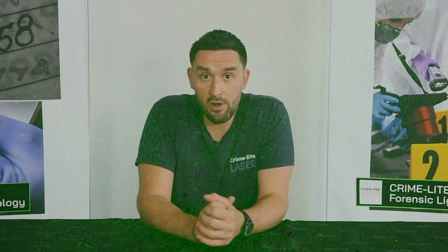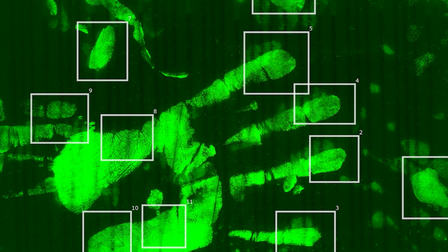Previously a widely used technique, DFO has now largely been replaced in many laboratories by the superior 1,2-indandione, a chemical process that interacts with metabolites or other components within fingerprint residue to again produce a brightly fluorescent coloured compound.